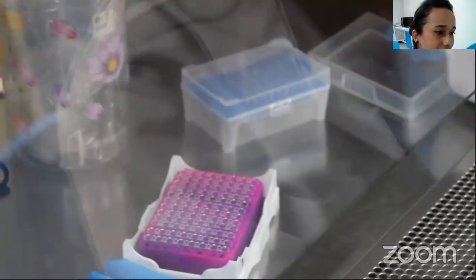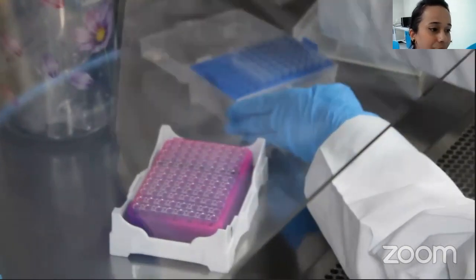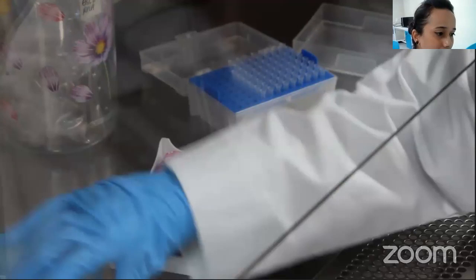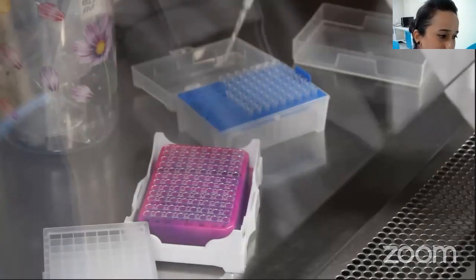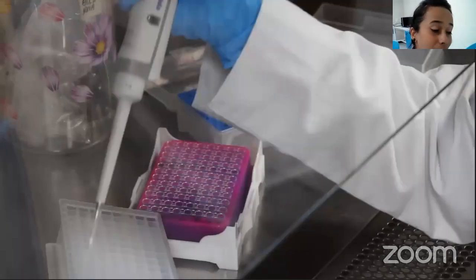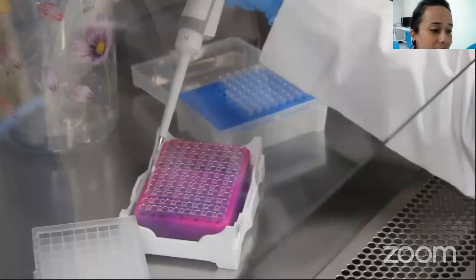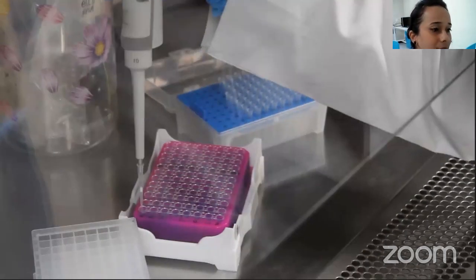Now this is a plate which was prepared earlier, and all the wells contain PCR master mix. Remember, 8 microliters of RNA template will be added in the corresponding wells. The white plate contains the RNA samples freshly extracted, and it also contains the NEC, that is the negative extraction control.